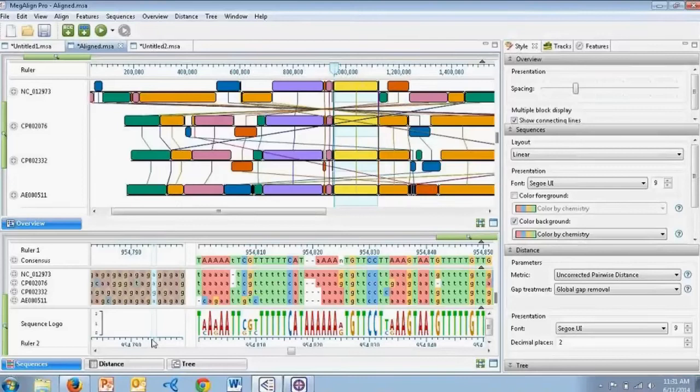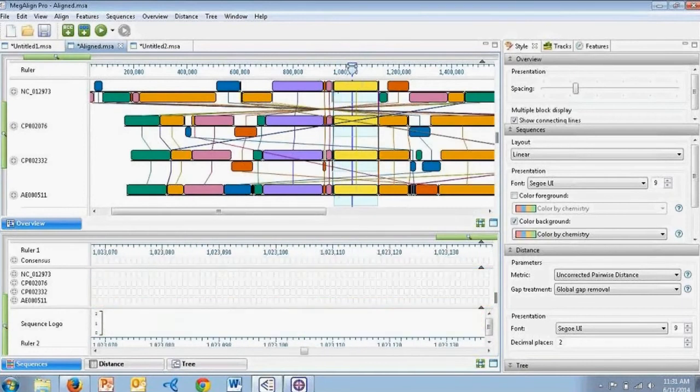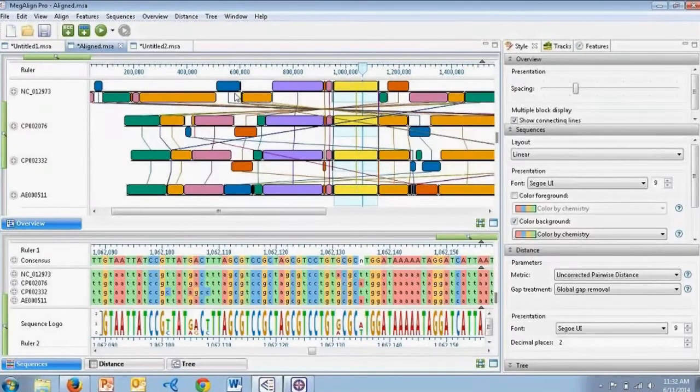These represent flanking sequences immediately adjacent to the currently selected block and appear as unaligned, ungapped, and without a consensus. To see additional details for these dimmed sequences, we have to select the corresponding block in the overview. What is bright in our color scheme is what the viewport is currently centered on in the selected block, so we can easily scroll through our selected block using this viewport, as we've done in some of the other alignments.